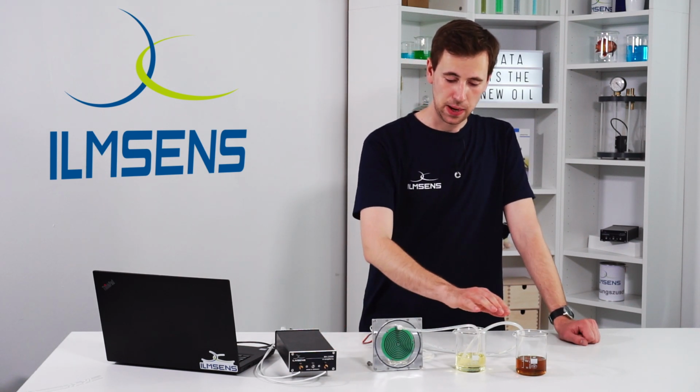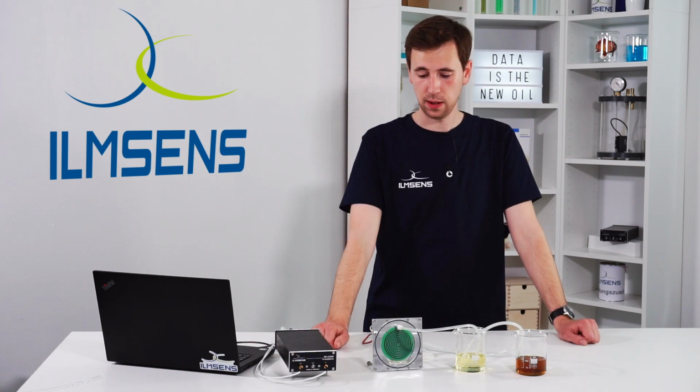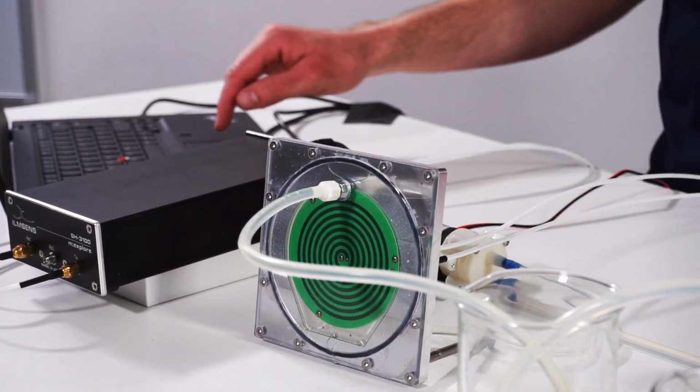The oils will be pumped through this cell with the help of a small pump. And as soon as the cell is filled with the oil, we can start the measurement. So let's just get started.